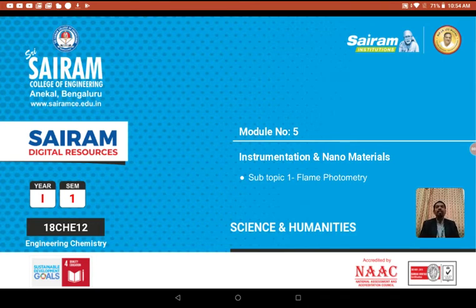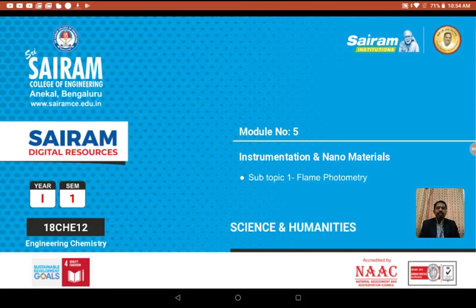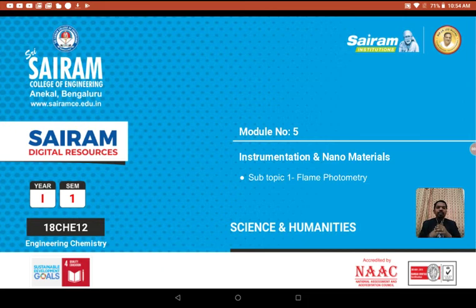What is flame photometry? It is similar to colorimetric estimation. In flame photometry, we are sprinkling the solution of a particular salt. The basis here is something all of you have done in your plus two experiments. The confirmation test for potassium, calcium, and barium is the flame test. You take a salt, make a paste in acid, and expose it to the flame using a glass rod. Calcium gives brick red color, barium gives apple green color, and potassium gives lilac color.